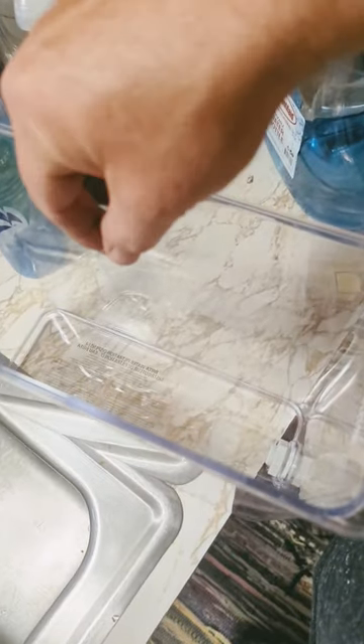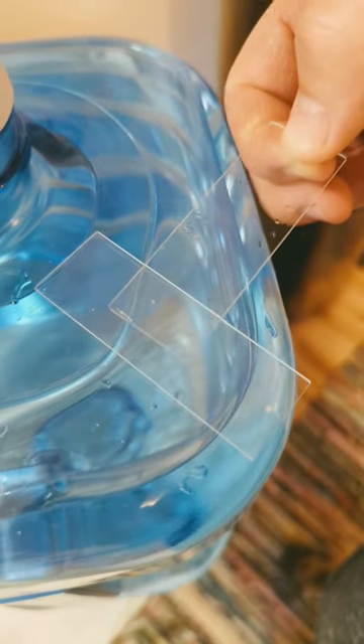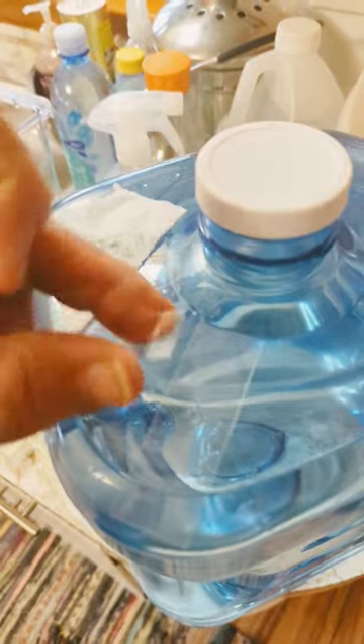I'm gonna scrape some out with this glass slide and put it on a clean slide. This slide is clean too. We got some — let's just transfer it and drop it on a fresh glass cover. Watch out, these things will cut you bad.